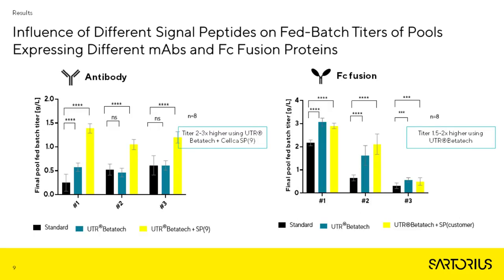So we expanded that further, and we did the same exercise once again with 3 other products: 3 antibody molecules and 3 FC fusion proteins. And these are again the results. These are the final pool fed batch results from those pools.